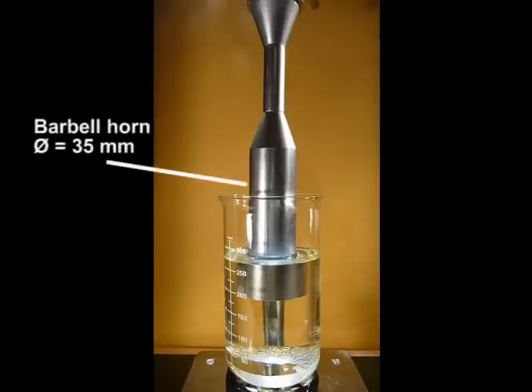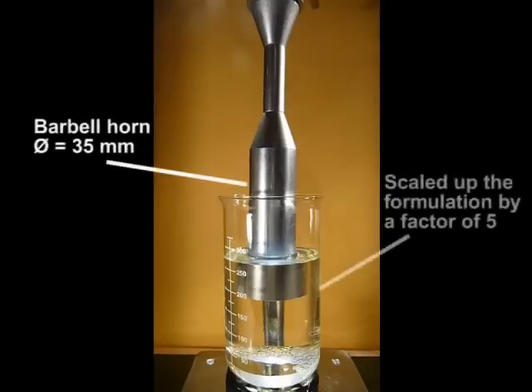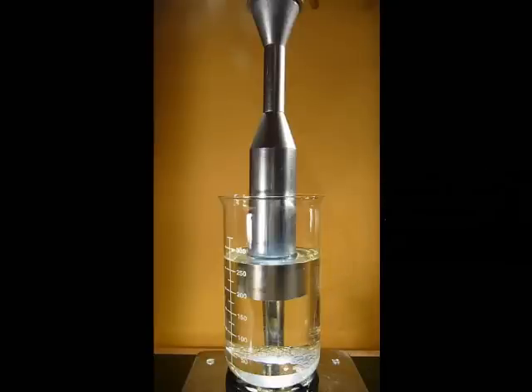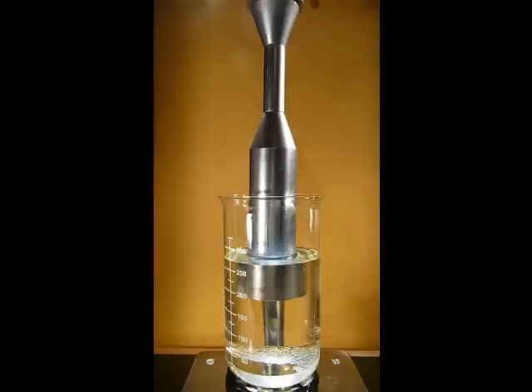We are now going to demonstrate the concept of scaling up the process by using barbell horns. We are going to repeat the previous experiment using a barbell horn with an output tip diameter approximately 2.2 times greater than the tip diameter of the horn used in the previous experiment. Therefore the output surface, which is on the bottom there, is going to be approximately five times larger. Therefore, we have scaled up the experiment by a factor of five.